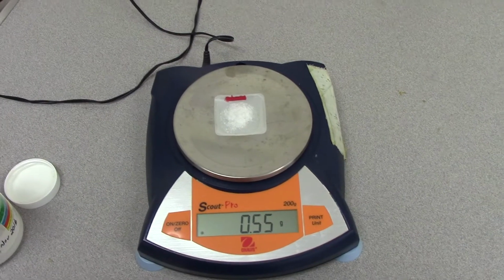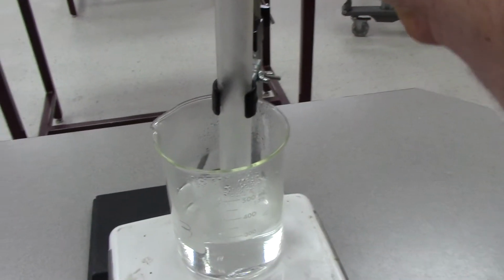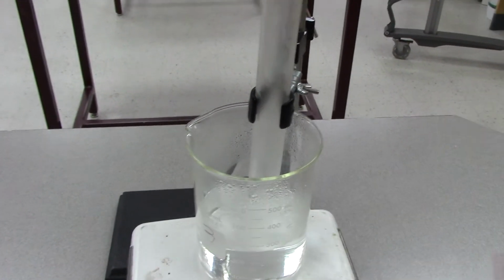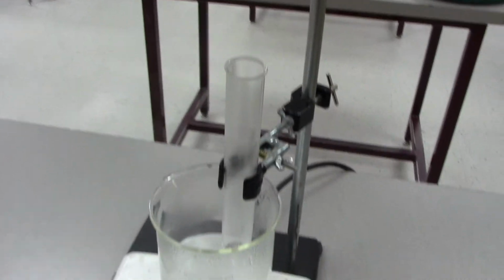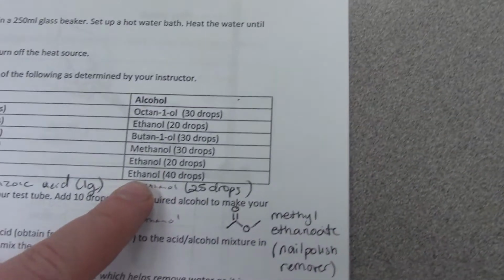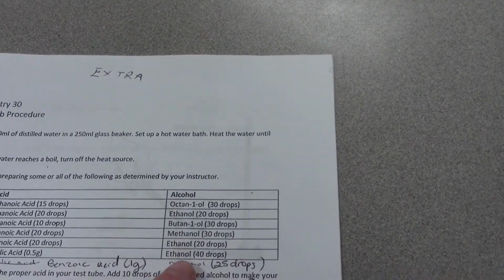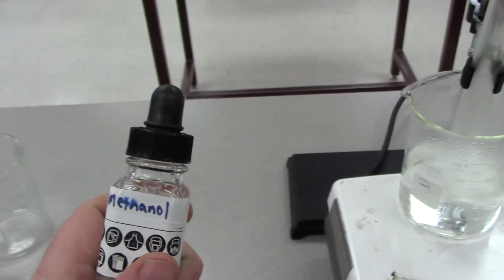Okay, so that's measured on the weigh boat. It's a little over half a gram, but I'm not too concerned with it. It doesn't need to be super specific. The salicylic acid goes in the test tube. And I need 40 drops of my alcohol. Now I'm going to use methanol, and I'm going to use 30 to 40 drops of the methanol.